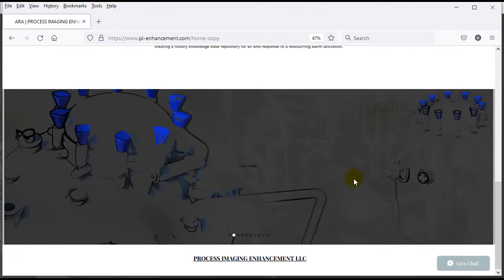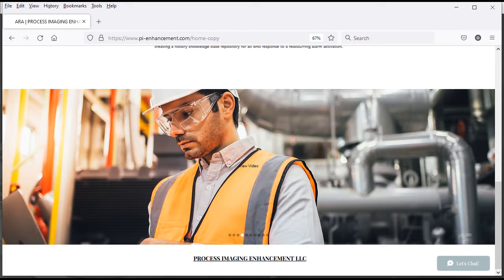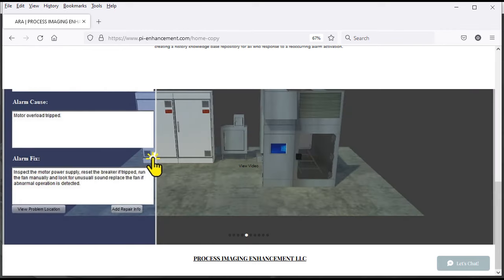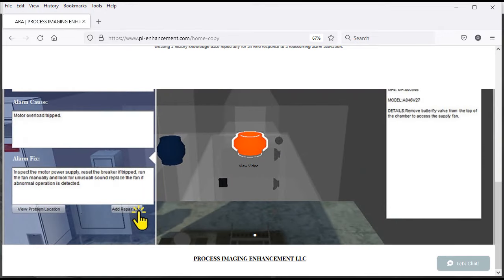A.R.A. was developed to fill in the gaps between GMP equipment, documentation and technician experience. Having a broad range of experienced mechanics working with new equipment means everyone is at the same level in regards to familiarity with your manufacturing equipment. How can the learning curve be accelerated effectively? Alarms Response Assistant is the answer.